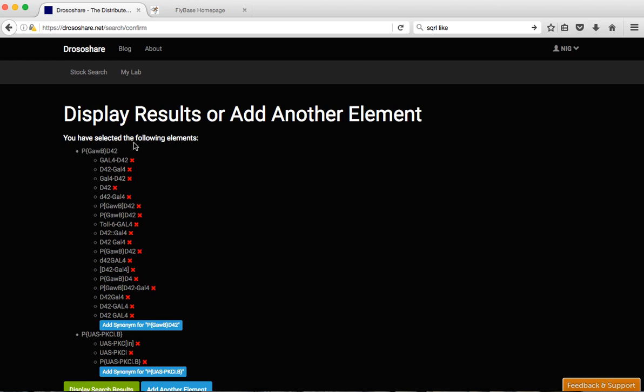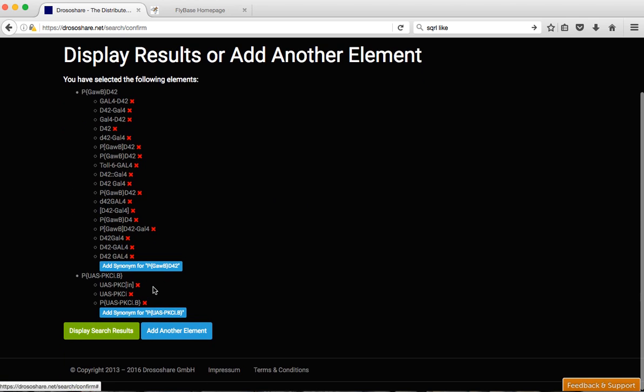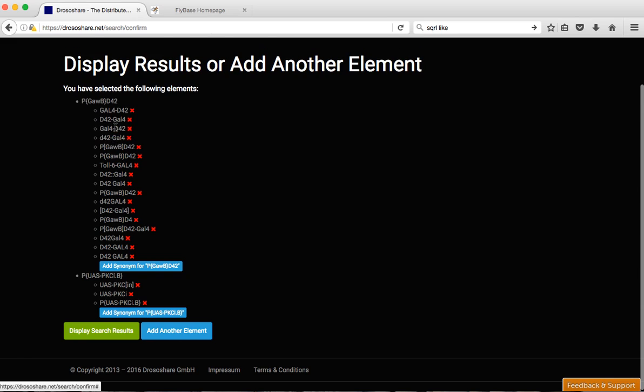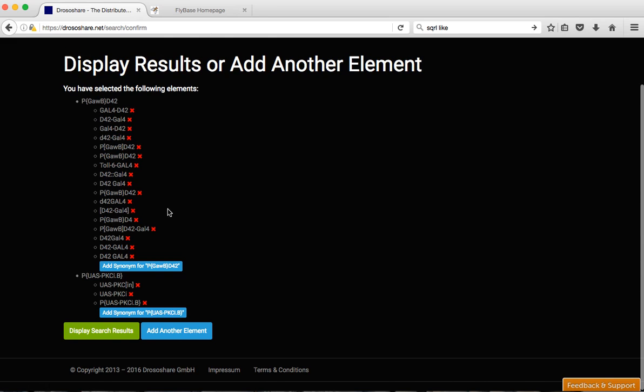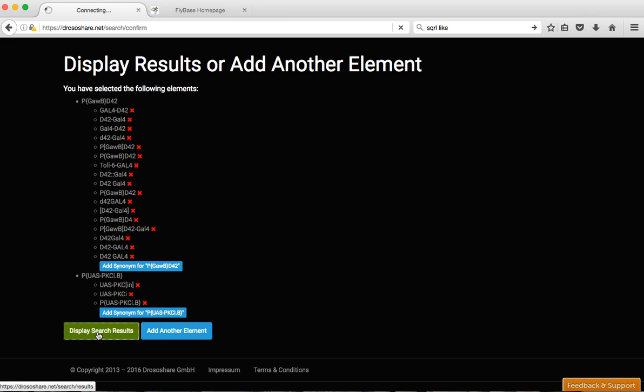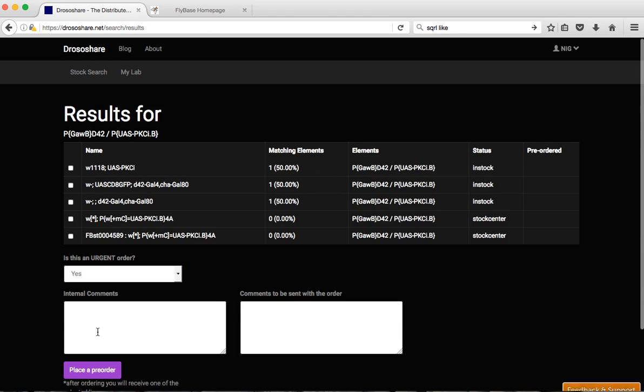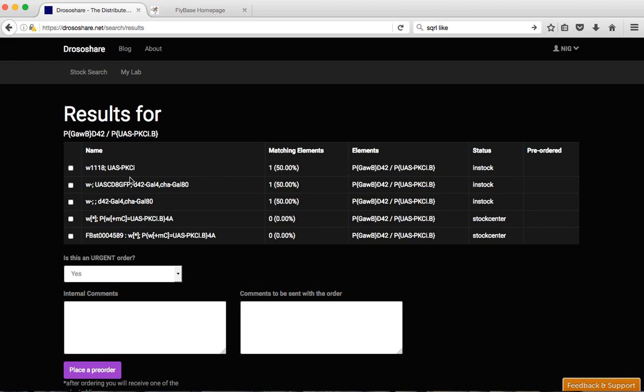So you'll see that we have a lot of things to search. I'll take that out because it may be non-specific and let's just try to make a first search to see what we get here. So you see here different names cross with different hits of what we looked for.